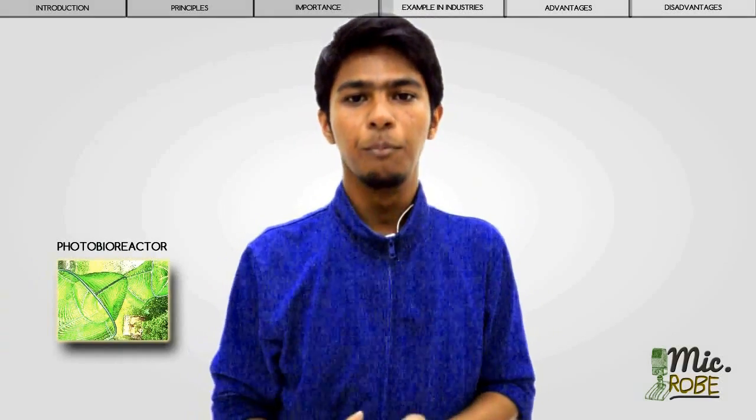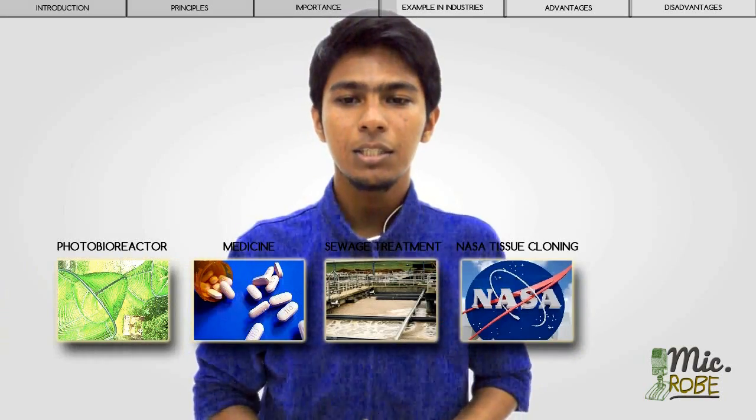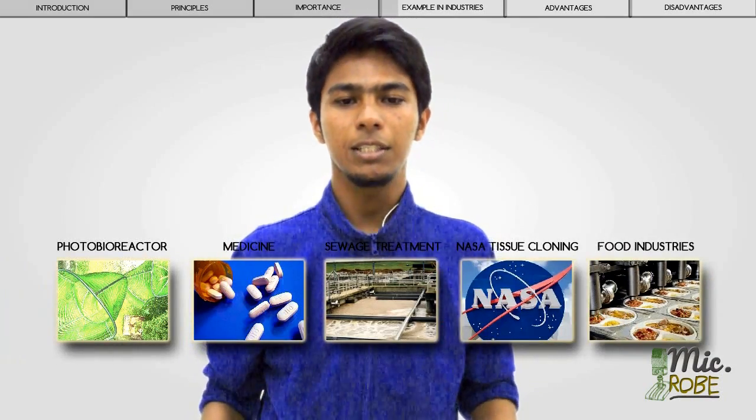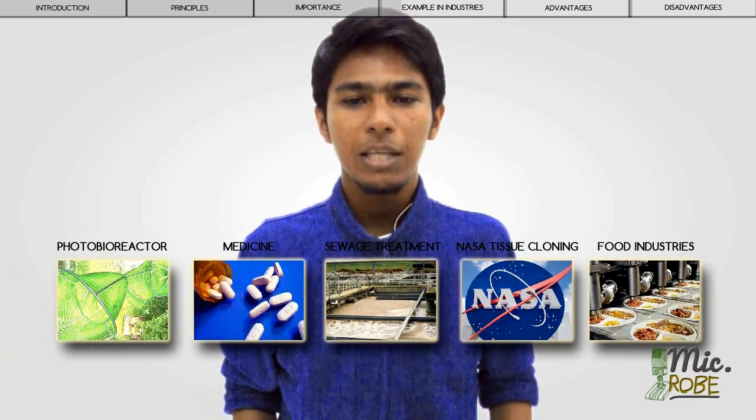Okay, today I'm going to talk about the example of bioreactor in the food industry. For your information, bioreactors are involved in many industries such as photobioreactor, medicine production, sewage treatment, NASA tissue cloning bioreactor, and food industry. However, in this video, I will just go through the example of bioreactor in the food industry.